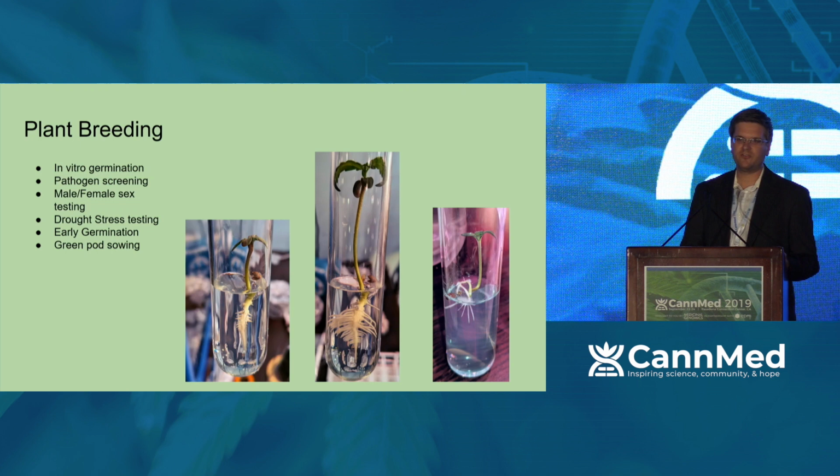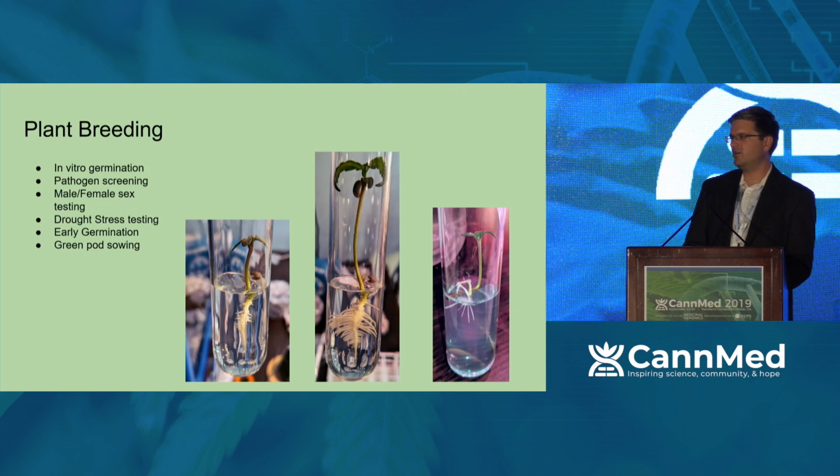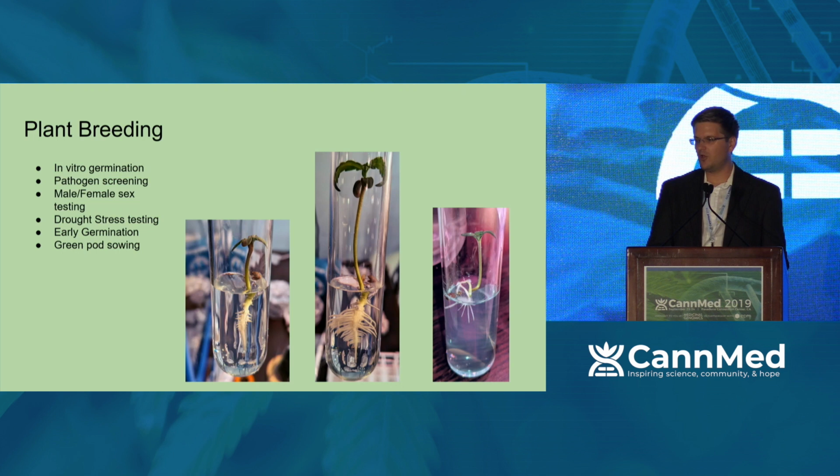Medicinal Genomics, I know, has a female-male indicator for sex testing, and what I found was if I grew them in a test tube, I could pop open the lid, take a little bit of tissue sample, run it through PCR and extract the DNA, and see whether it is male or female. Since it does not detect hermaphrodites, it was a somewhat biased test, but at the same time it gives you the sex of that seedling. That allowed you to separate the seedlings out in your room, and you could then grow all female or produce a much higher quality breeding program.